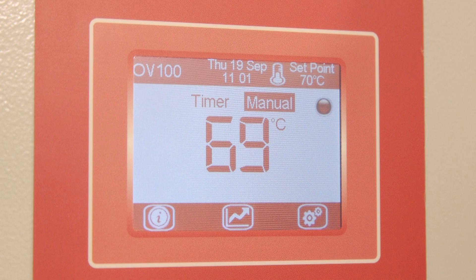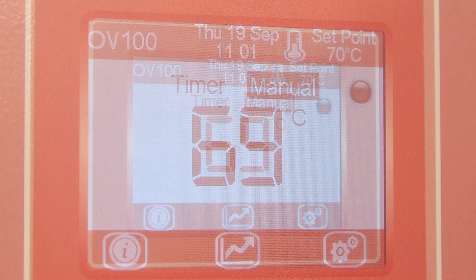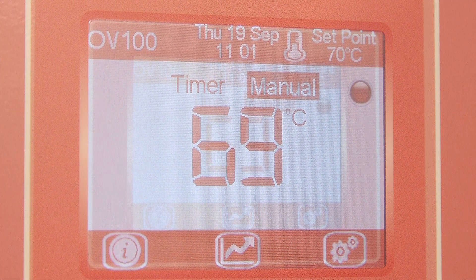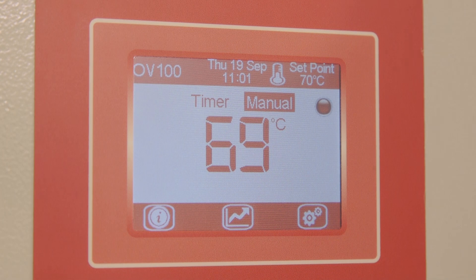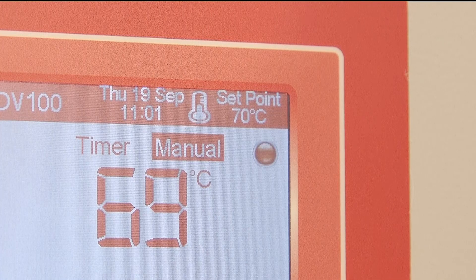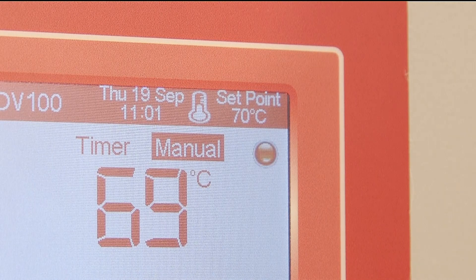The home page is packed with information about the state of the oven. The large central number is the current temperature within the oven chamber. The start/stop button is to the right of this number. When red, the oven will control to the set point shown above.